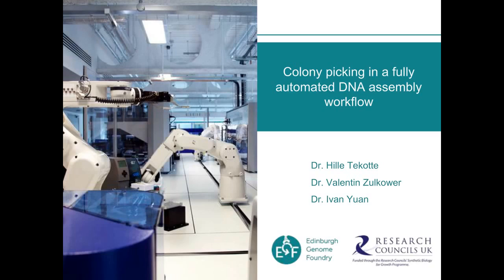Thank you very much for this opportunity to present the Edinburgh Genome Foundry. We are a newly established facility for synthetic biology at the University of Edinburgh in Scotland. DNA assembly is one of the key processes to enable synthetic biology, and this can be easily automated. We would like to give you an overview of how this is done here at the EGF.